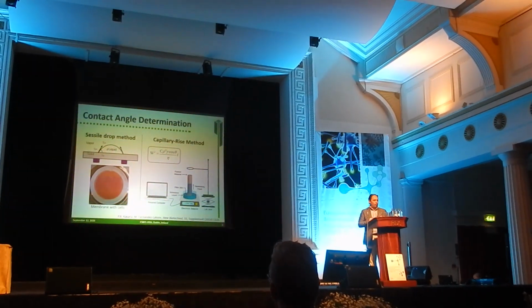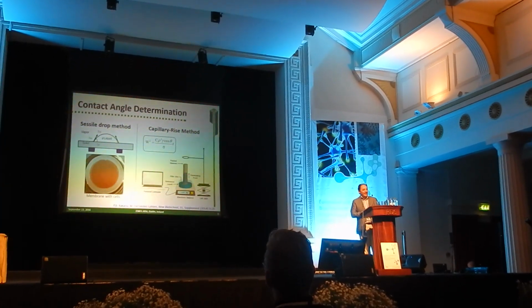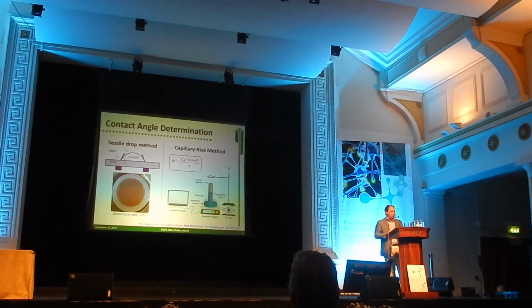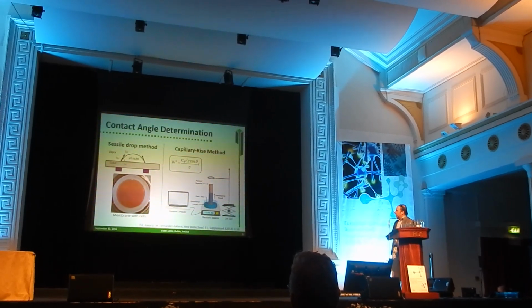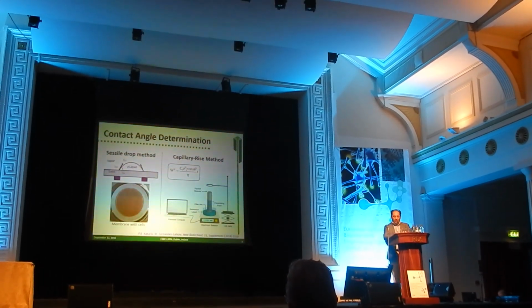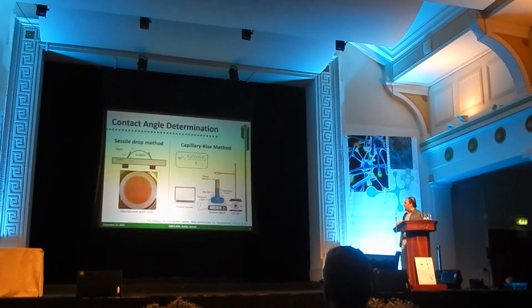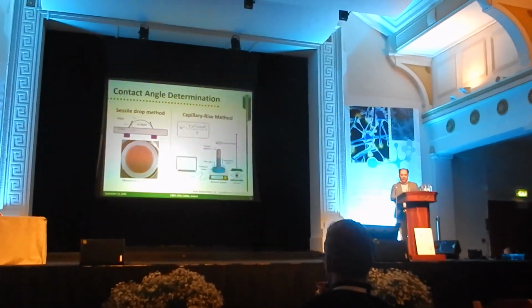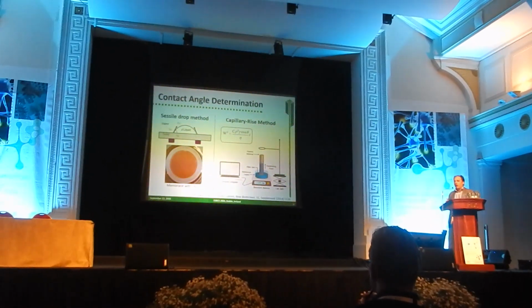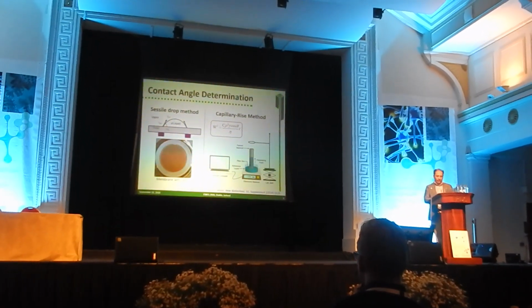And then, of course, a nice colleague of mine started criticizing my paper, saying, okay, but the bead, if you are breaking it, the inside is not the same as the outside, or whatever. So he has got a point, I would say. So we went into the development of another technique, the capillary method, where you actually pack your beads in a small tube, and then you can determine contact angles, which are calculated from the capillary penetration of different diagnostic liquids into this small packed bed that you have there, which resembles very well the situation under chromatography conditions.